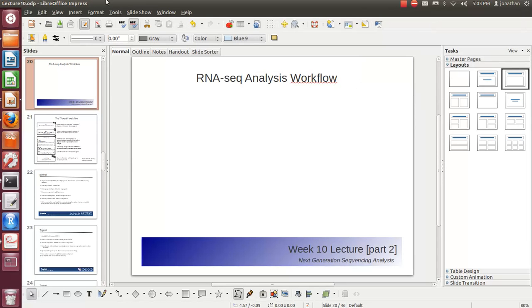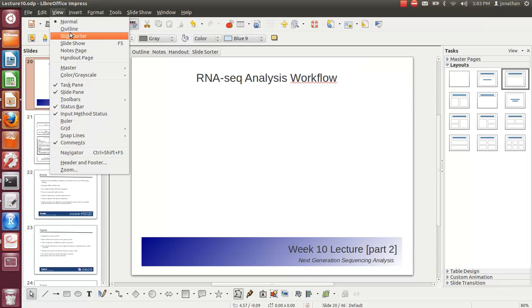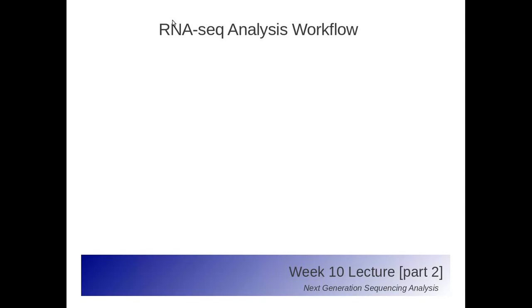So hello and welcome to the second lecture in the week 10 introduction to RNA-seq analysis. In this version of the lecture, I'll be giving you an introduction to an RNA-seq analysis workflow. This is one of a number of different workflows that are available for conducting RNA-seq analysis, but this is probably the most popular one in part because of its simplicity of implementation.